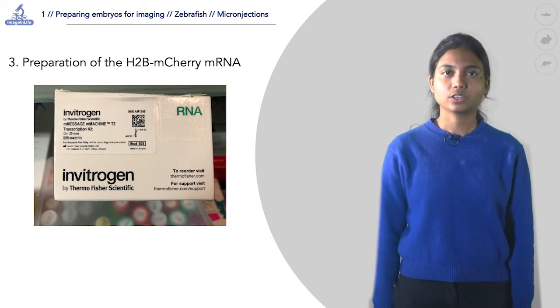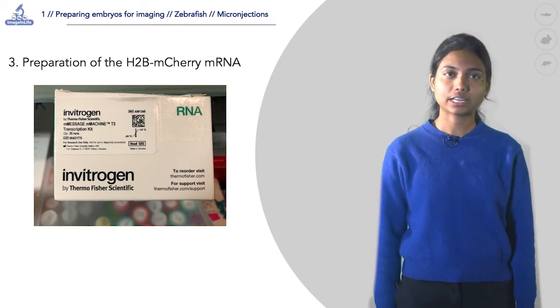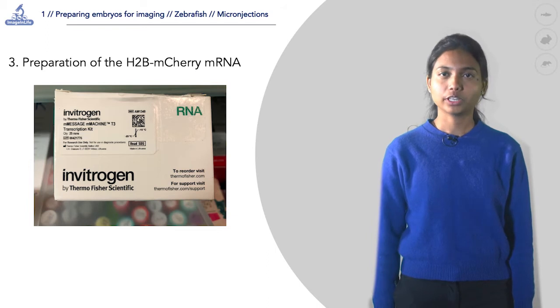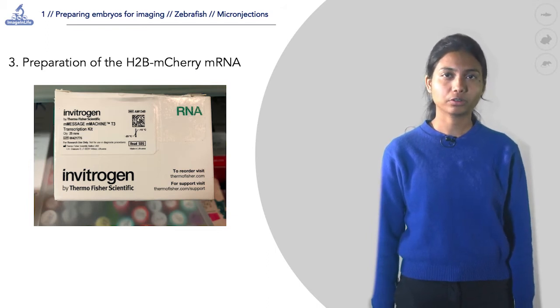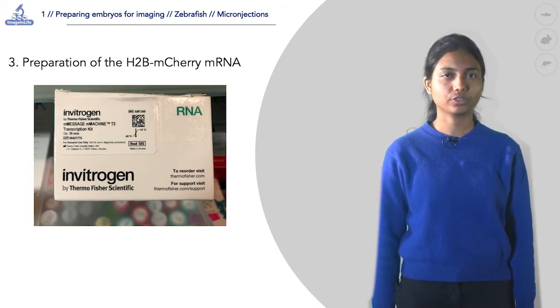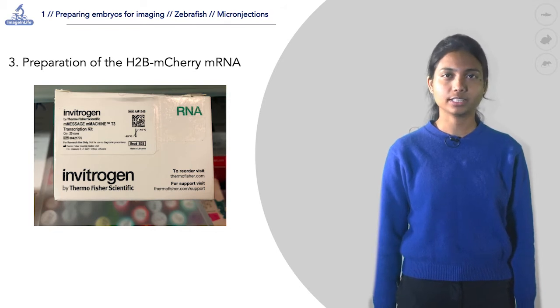RNA is synthesized using an mMessage machine transcription kit, then diluted in water to 100 nanograms per microliter and stored in aliquots of 10 microliters at minus 80 degrees Celsius.